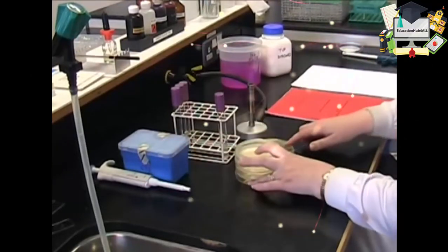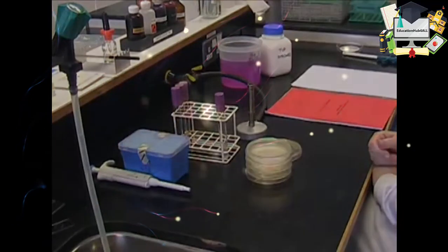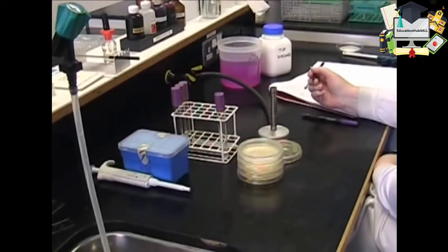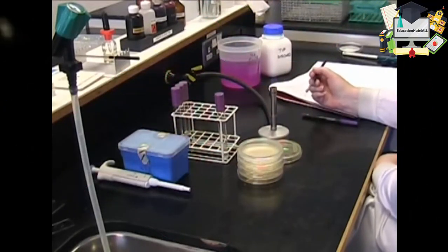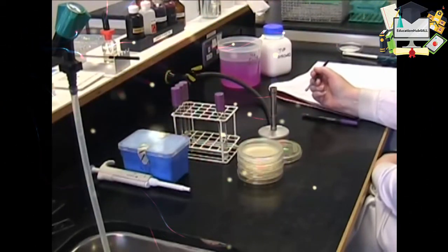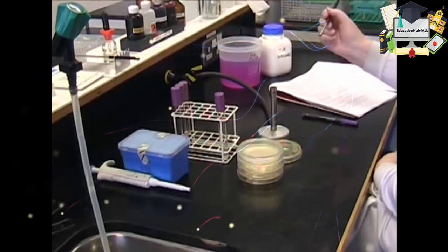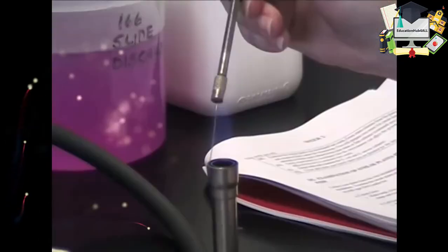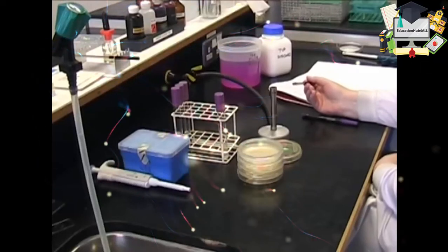So we're going to show you now how to streak a plate using good aseptic technique. One of the most important aspects of aseptic technique is flaming your loop. You need to make sure that your loop is sterile before you use it, and we do this in a specific way. We put the loop into the top of the flame, and draw it up slowly through the flame so that the loop is the last part to be heated. We remove it from the flame and just allow it to air cool.